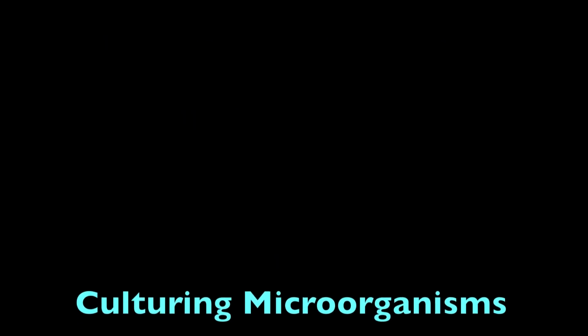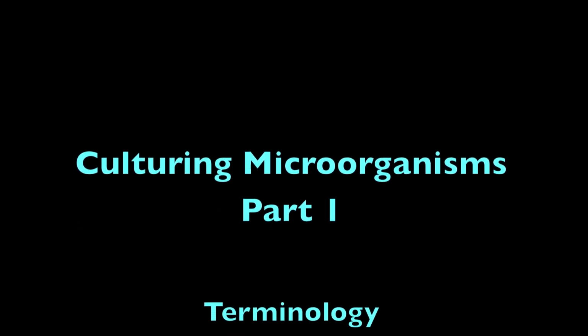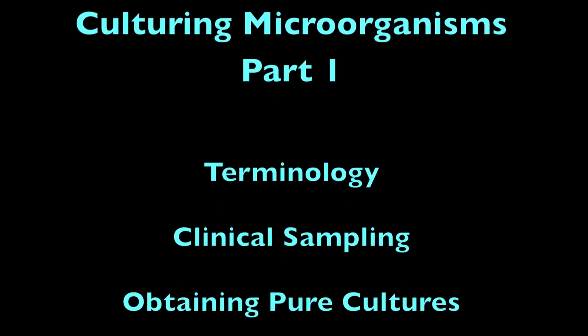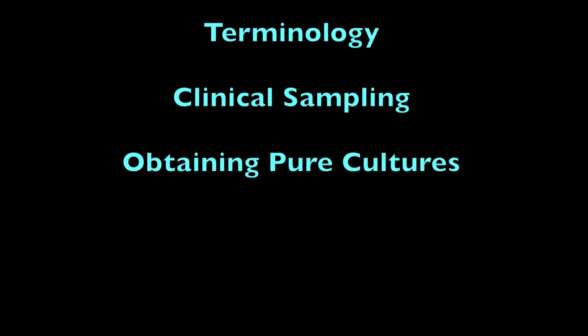We will begin to discuss important concepts, techniques, and materials needed to cultivate microorganisms in the lab setting. In this video, we will explore important terminology pertaining to culturing microorganisms, concepts in clinical sampling, and procedures utilized to obtain pure cultures.